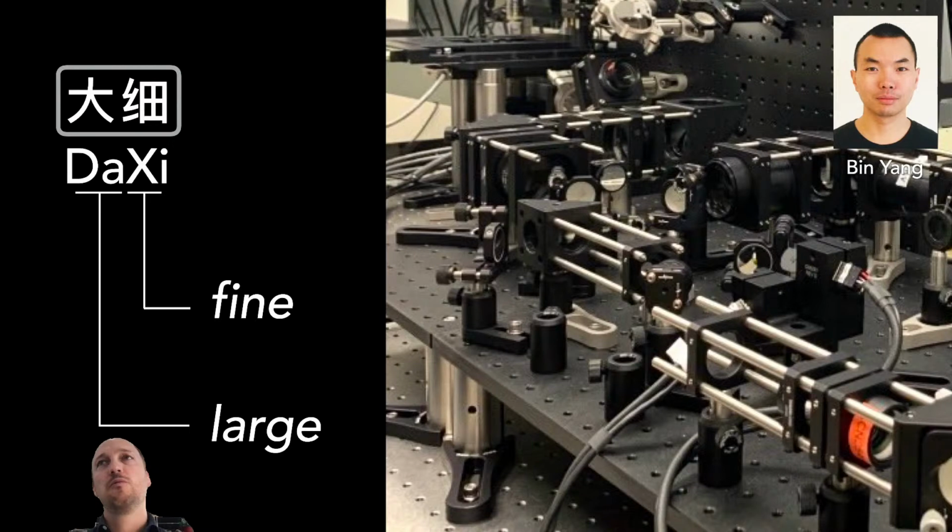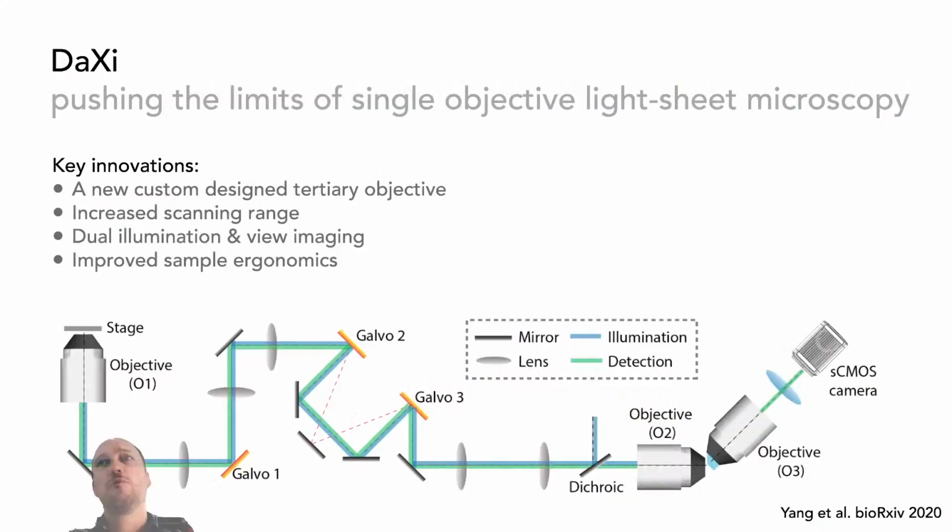And so this is actually a picture of the setup. In a schematic way, this is how it's set up. The key innovations of this microscope are that we have a new custom design tertiary objective, we have increased scanning range, we have dual illumination and essentially dual view imaging, and we have improved sample ergonomics.